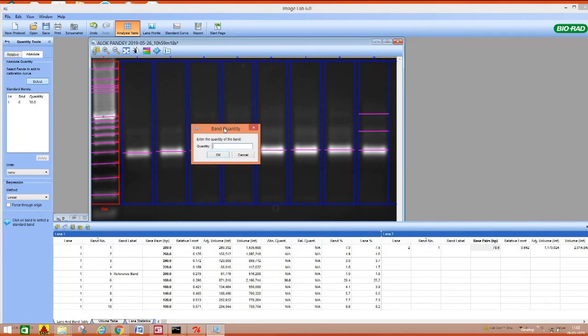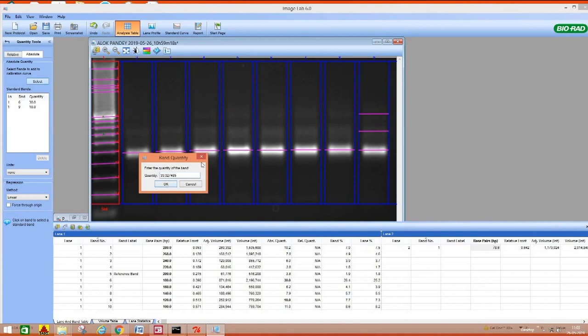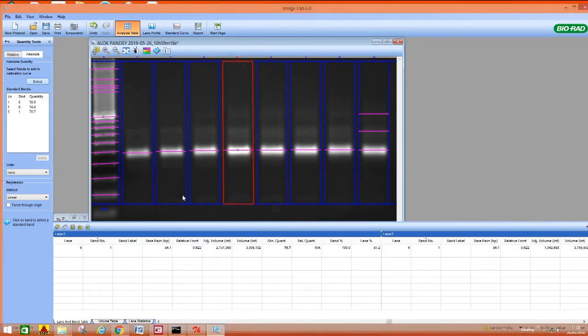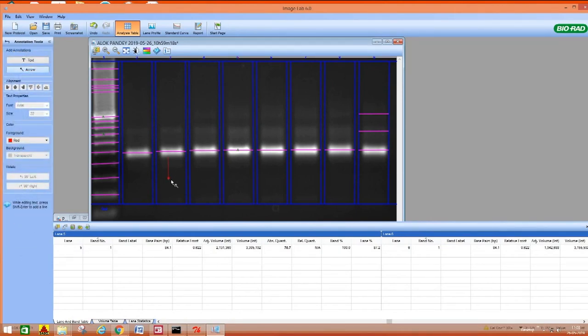So another band, at least we need two. This is 10 nanogram. After giving two values, you can click any band. Suppose this one 39.92, this one 55, and this one 63, this one 64. So in this way you can calculate the intensity absolute quantity of any given band. You can use annotation tools also by giving arrow or representing graphically also. You can do same thing and you can export the screenshot also. So you can save these things and you can export. Here the export options are there, you can do exporting also.